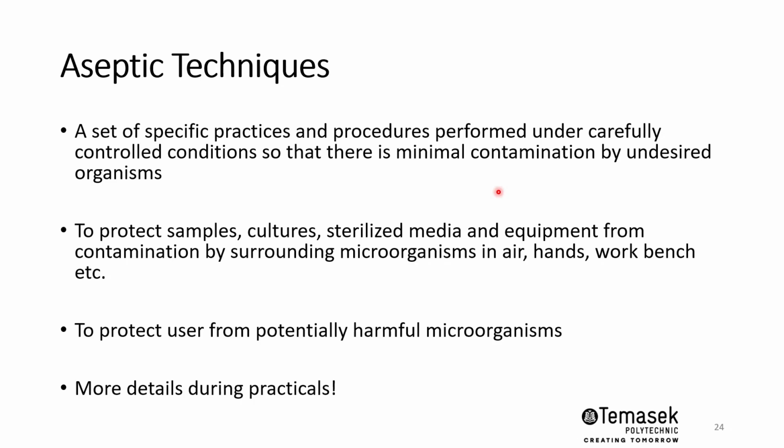So often we will need to protect our sample, our culture, and all other media and equipment from contamination by surrounding microbes. We know microbes are in the air. In fact, the air that we breathe in may contain fungal spores as well. Our hands also are covered with microbes, our benches, your tables, and so on and so forth. So aseptic techniques are essential, right? And you will get to practice this during the practical. Importantly, it also helps to protect the user from potentially harmful microorganisms.